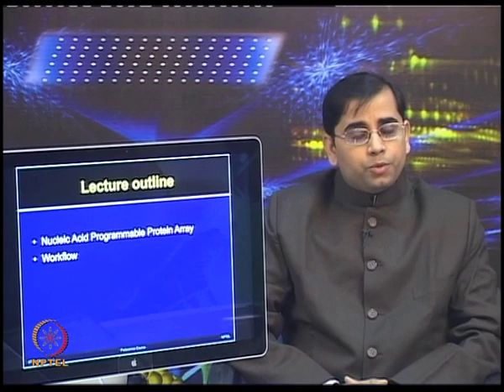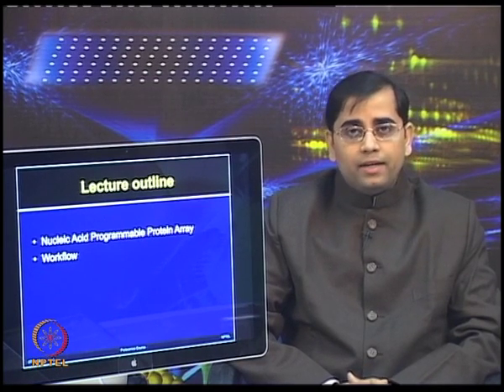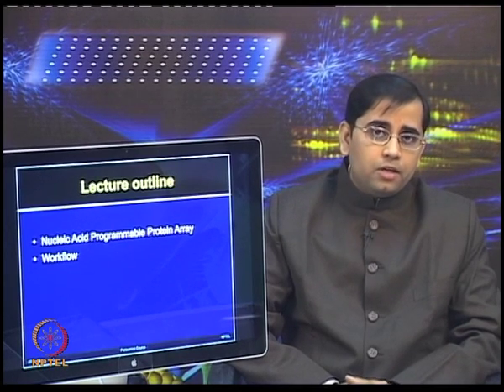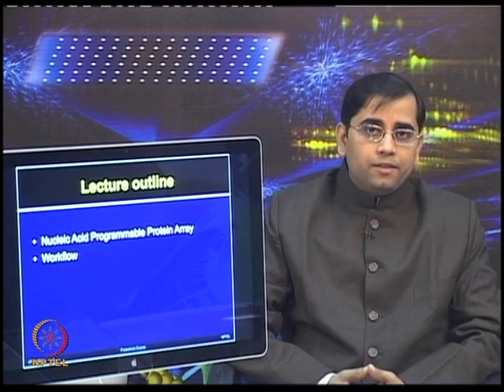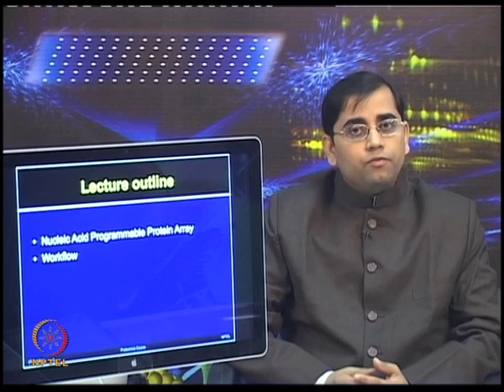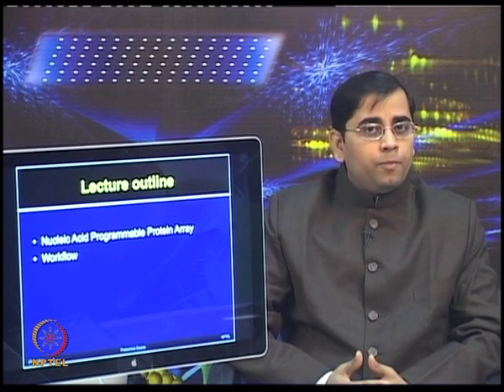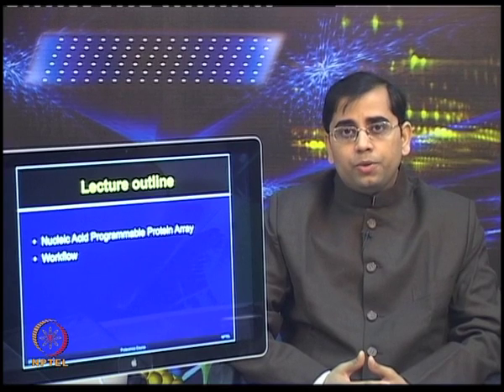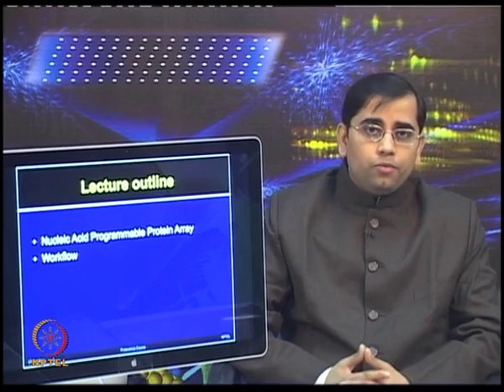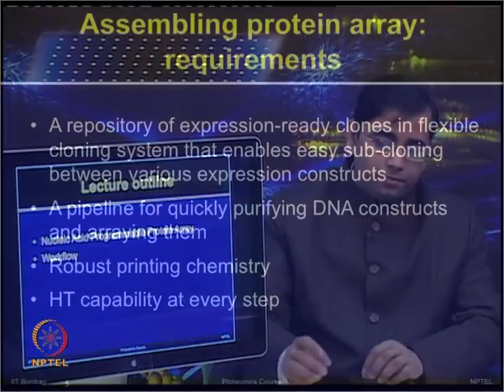Then in the NAPPA approach, one needs to ensure that DNA printing is of good quality as well as protein expression is good. So, all those quality control checks, as well as what different types of control features one needs to have on these arrays, so that during various types of application one can make sure that they are relying on good data. So, we will walk through all this process in the workflow.